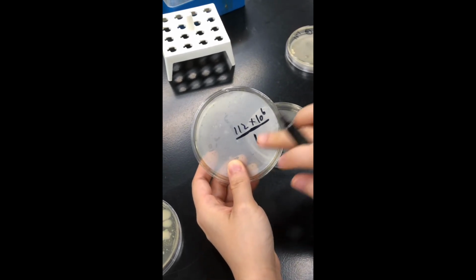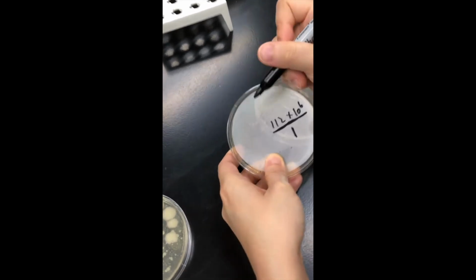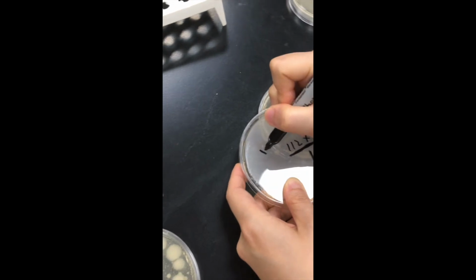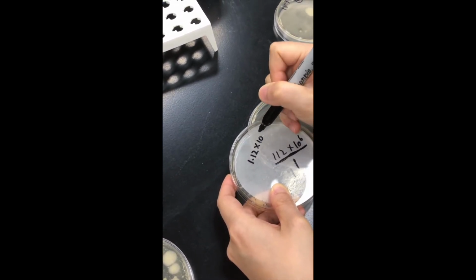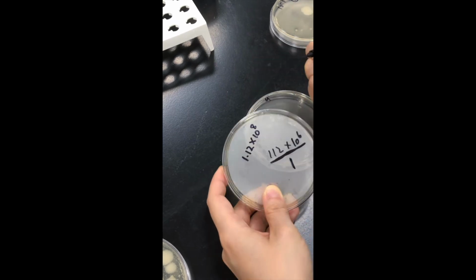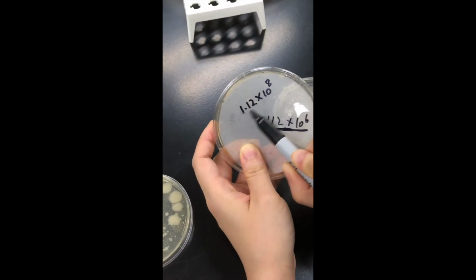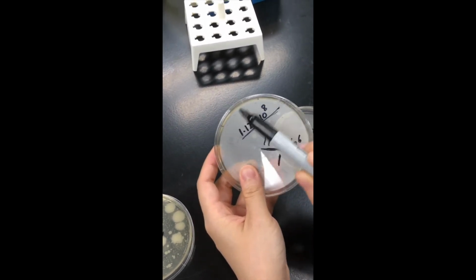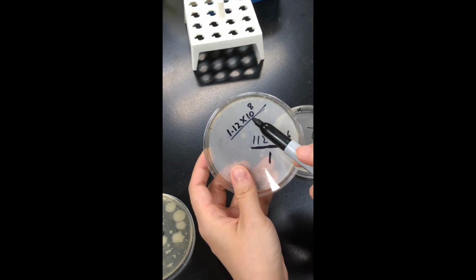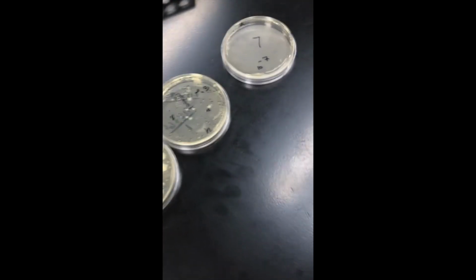Okay, we need to write it in scientific notation. So this number equals 1.12 multiplied by 10 to the 8. We need to write in scientific notation as shown here, and this is the concentration of our unpasteurized raw milk. Let's have a look at our pasteurized.